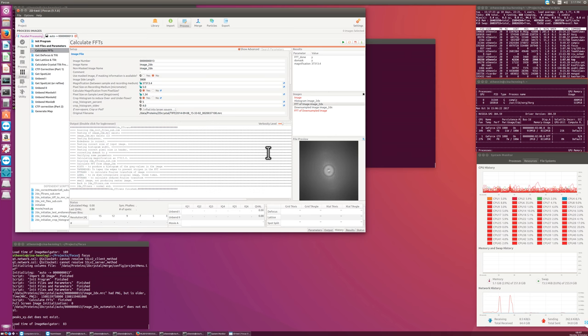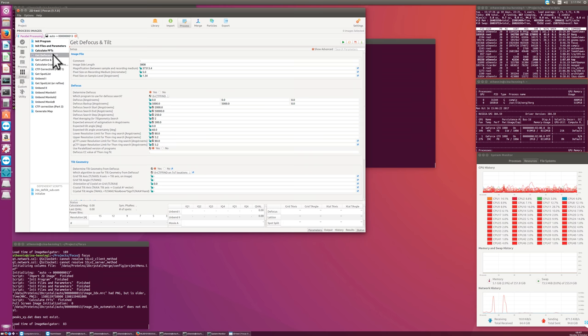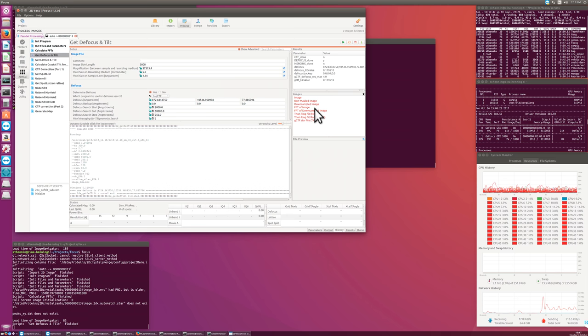So the next script computes the defocus and tilt in this image, and I do not want to record or calculate the tilt geometry right now based on a defocus gradient, but just the defocus. And for speed reasons, since we run on an Ubuntu machine, I can run GCTF, that's faster. Kai Zhang's program, that's amazingly fast, that produces Thon ring fits.